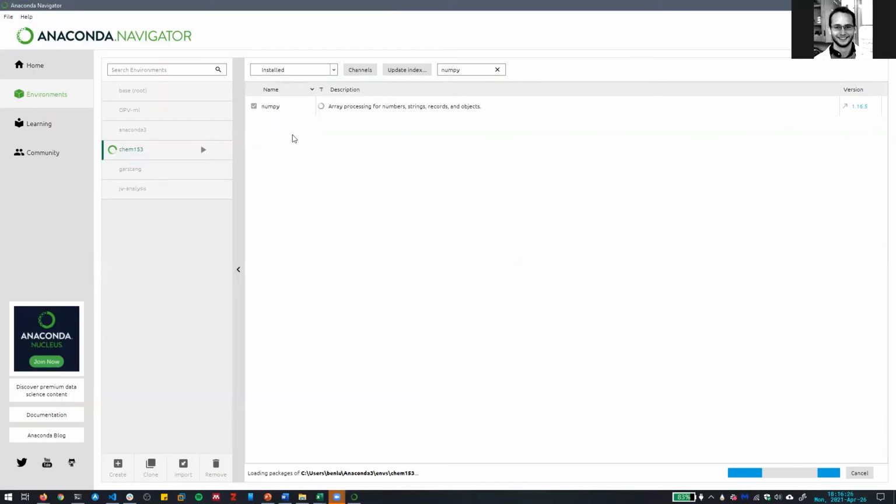You can also work with your base environment and install packages, but the best practice is to create a new virtual environment like this, basically for every project that you do. So for this class, I'm hoping we'll be able to do everything we need to for GCMS in here, and then maybe we'll do a little bit with the HPLC lab as well, although there's less analysis for that lab overall, so we might not need to.